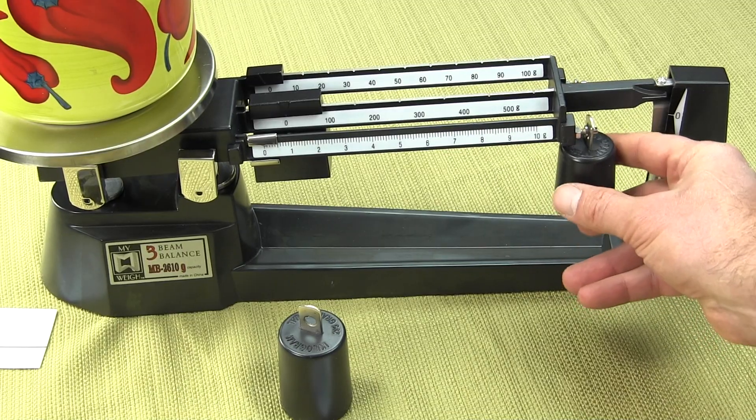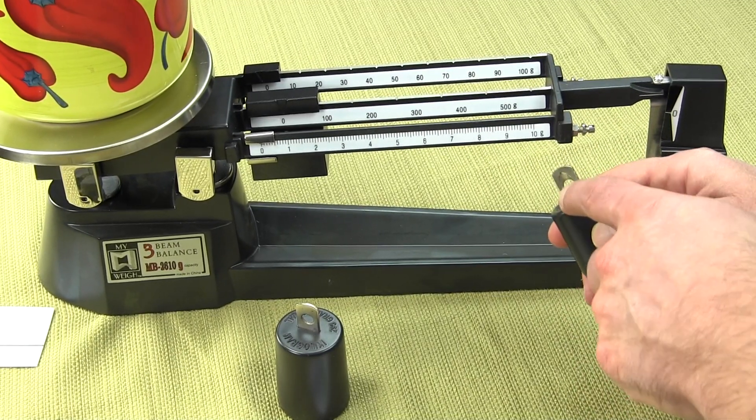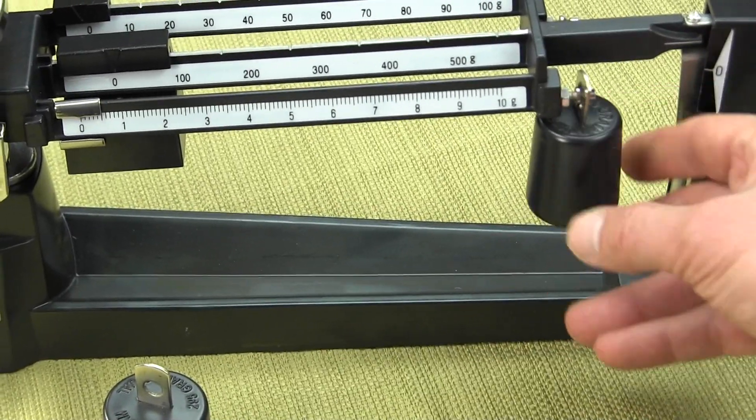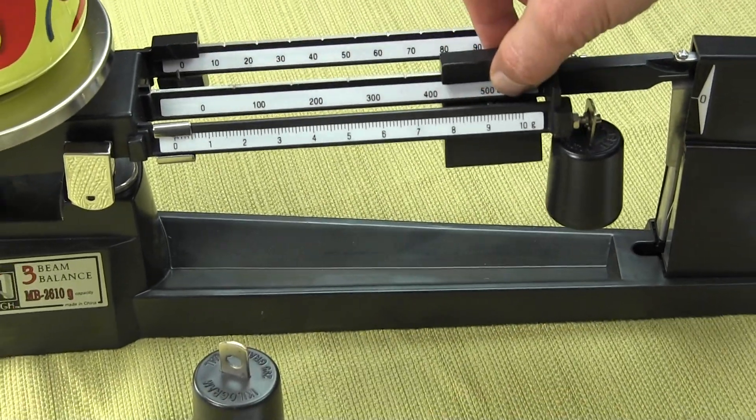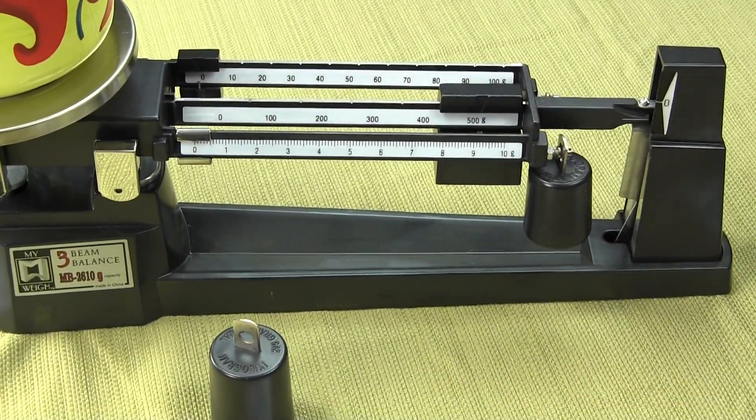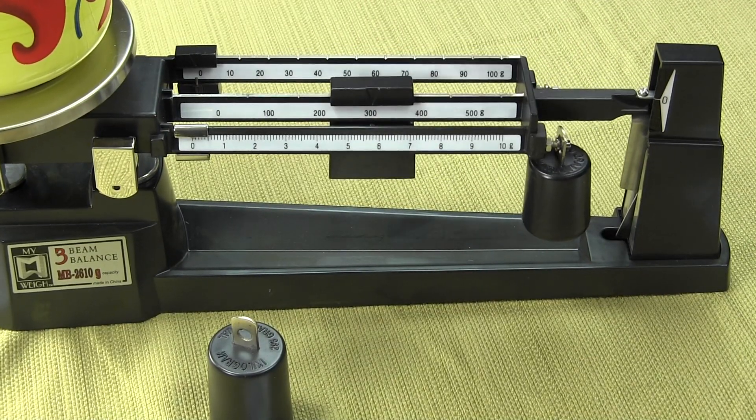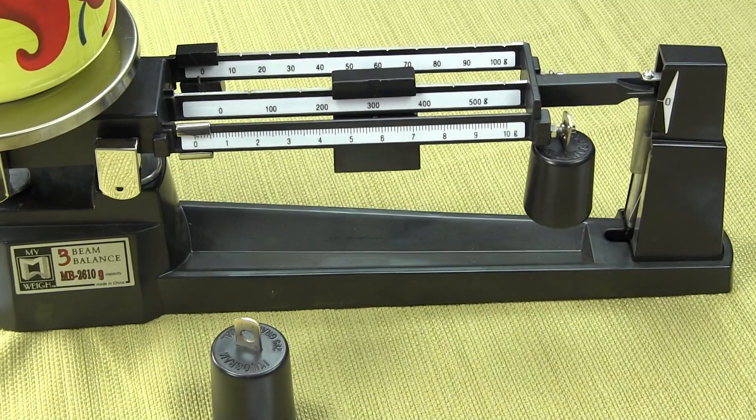We hang it right on there. You'll notice there's a groove on the attachment weight. That groove right there goes towards the beam. We're going to slide the 500-gram poise all the way until the beam goes down. Now we just start sliding it back. Now the beam's high here.